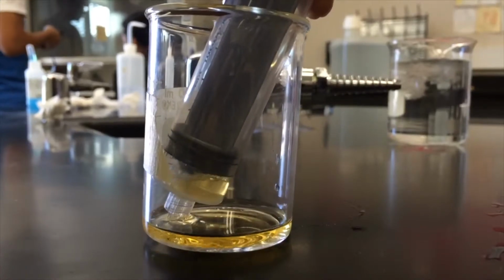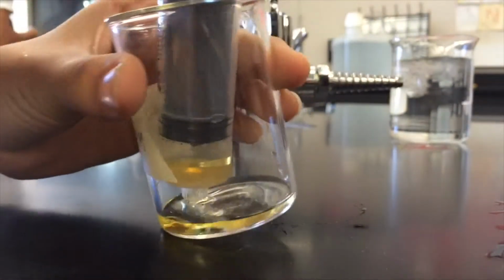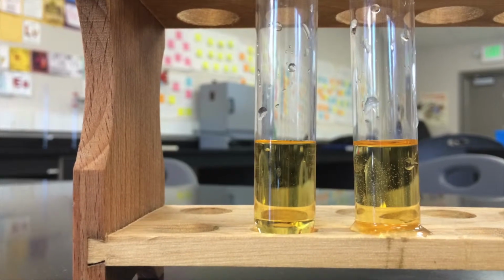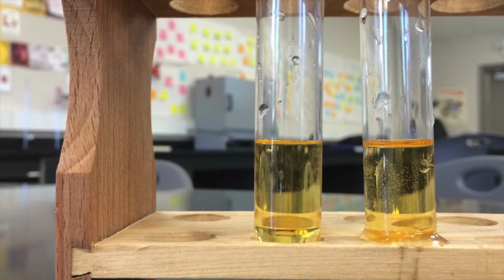Lastly, we altered the pressure of the experimental group by inserting all the experimental solution into a syringe. Then we pushed the syringe in to decrease the volume and therefore increase the pressure. We also pulled the syringe back in order to increase the volume and decrease the pressure. Once again, there was no change between the experimental and control.